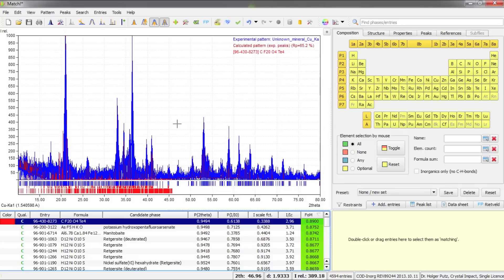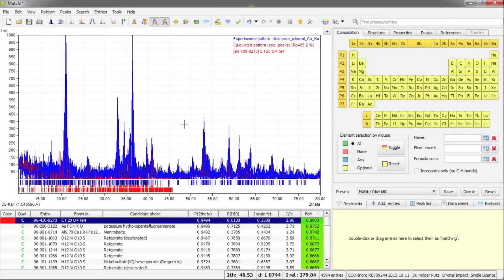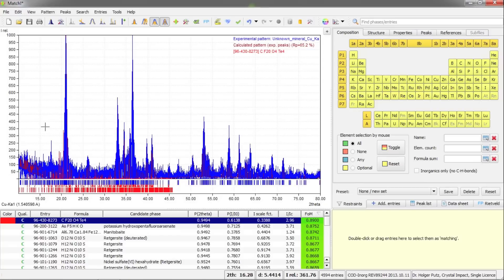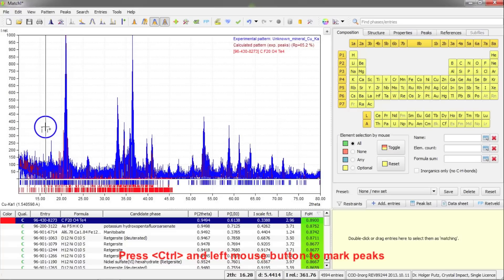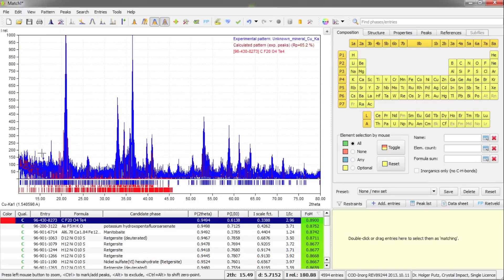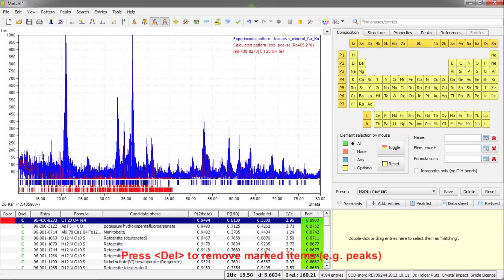Before I continue, I would like to show you what you could also do to get rid of these many surplus peaks. One option is to mark the peaks you would like to delete and press the Delete button. I'll move the mouse cursor to an appropriate position. Now, to mark peaks, I'll press the Control button and keep the left mouse button pressed while moving the mouse to the left. You can see the yellow range that has been drawn, and once I release the mouse button, all these peaks are marked. I can simply press the Delete button on the keyboard.